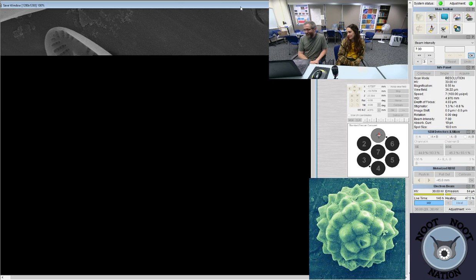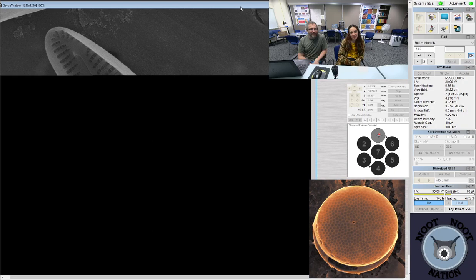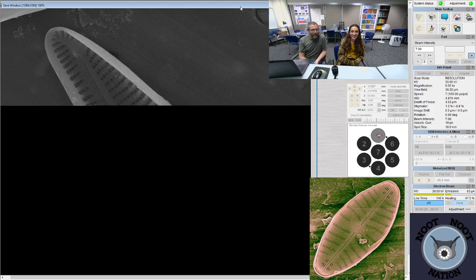Right, there are no mistakes, just happy little accidents. These diatoms had some happy little accidents, and they landed on my SEM machine. Happily coated in gold. Very fancy, though. Covered in gold and everything. I am the King Midas of diatoms. I just touch them, and they magically turn to gold. And then I stuff them in a vacuum.